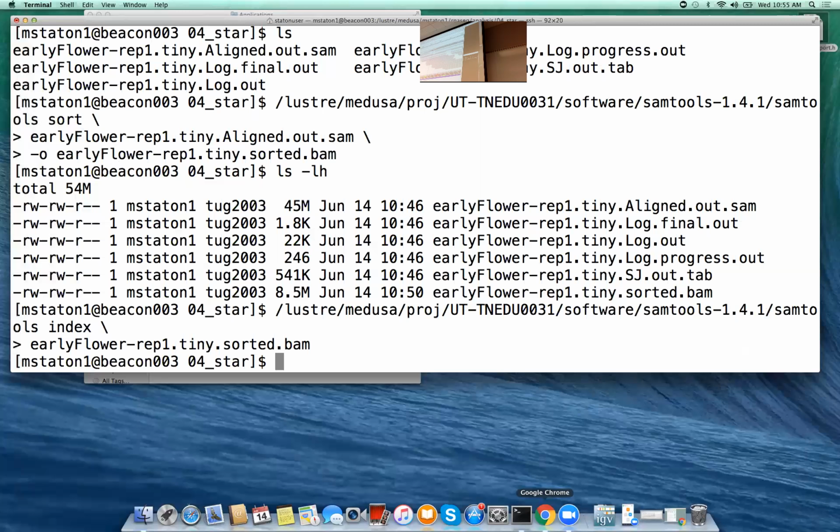So this was the homework for today. It was to find somewhere on IGV where you can see a read and see the gene, take a screenshot, and email it to me to prove that you made it this far in the lesson. That's your homework. If you're an enrolled student, you're just here for fun.